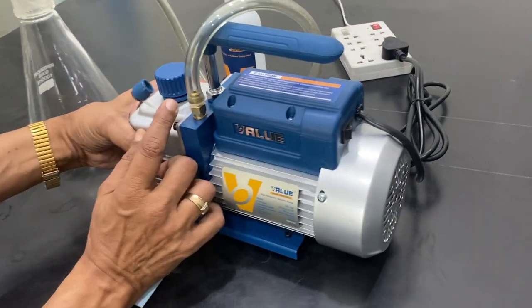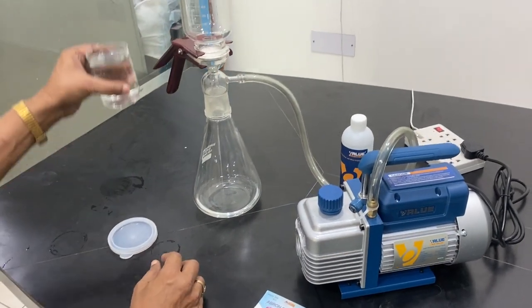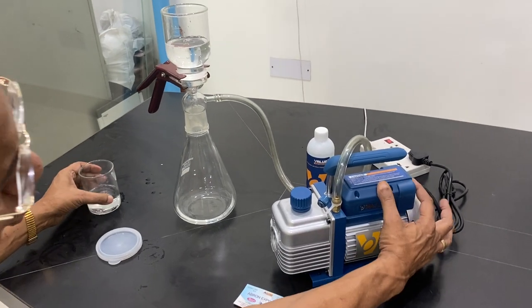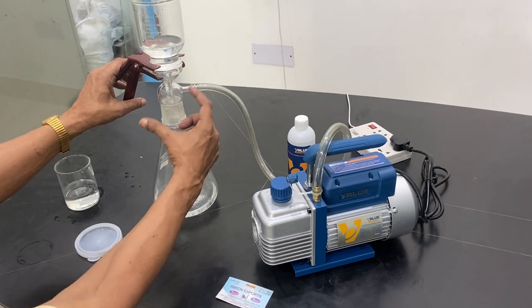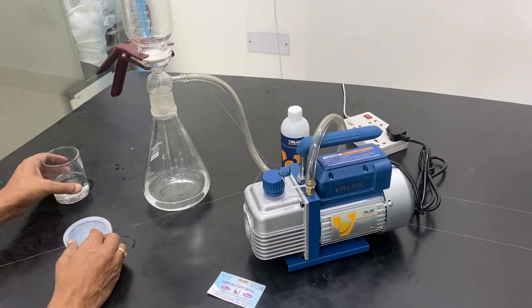There is an on/off switch here and you can attach the vacuum here. Let me show you how it is done. Now whatever you have to filter, you can put it inside this and switch on the pump. When you switch on, the air sucks — air goes out and the vacuum is very fast. It is done in just 30 seconds.